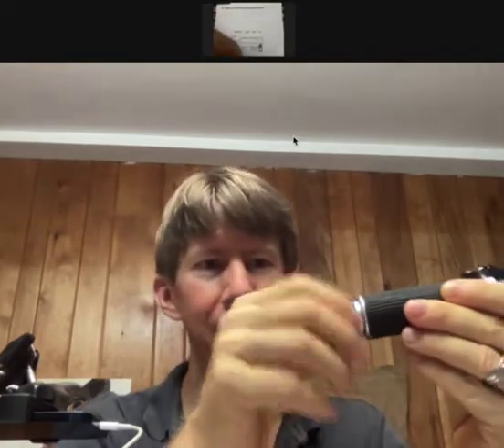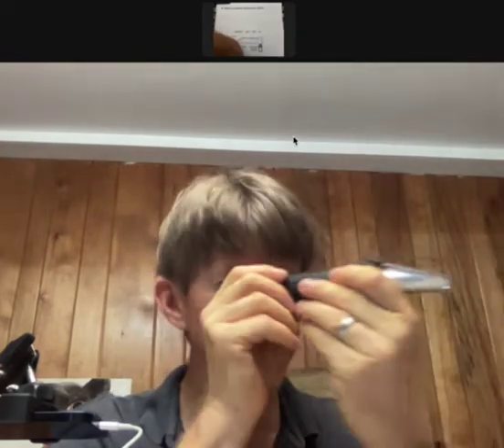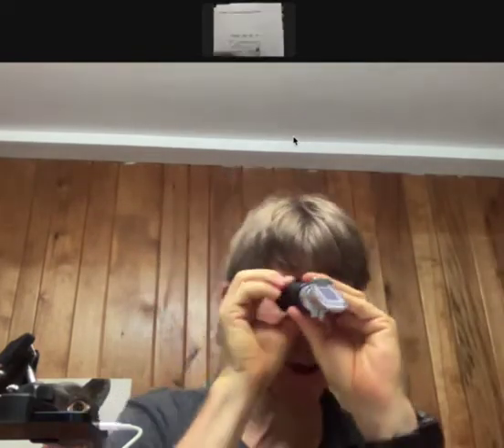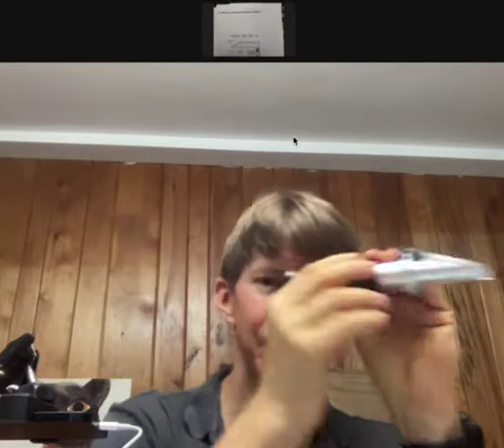The main adjustment that you'll have to make, other than to calibrate it once, is by turning this. So it tends to start or come all the way in. And for me, that's pretty blurry. So I have to unscrew it while I'm looking in here. And you can see the scale.